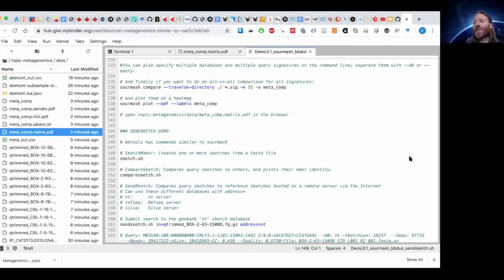And then that's essentially excluding erroneous K-mers. But I don't know how it works. People use Bloom filters to do K-mer correction by flagging erroneous K-mers and then comparing them to see if they can correct them. But that's a little bit beyond my knowledge at this point.